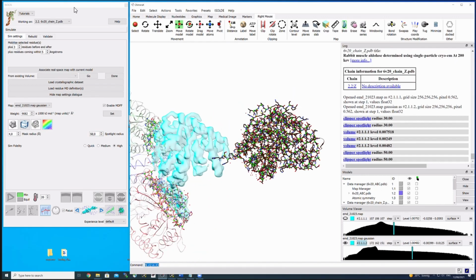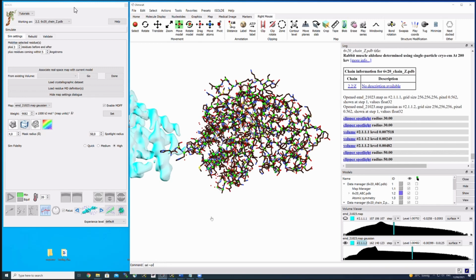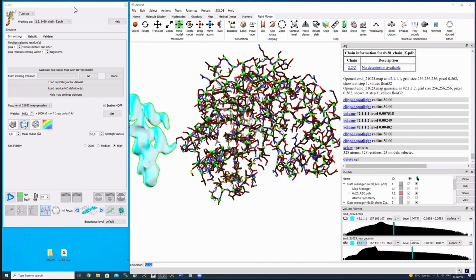the model for Isolde. As you know, this model has water molecules in it. I don't like that for now. Typically you don't face them anyway, I think, unless you get very high resolution. You're not building any water molecules. So with select tilde protein command, I can select everything that is not a protein, and with delete selection, the water is gone. First thing.